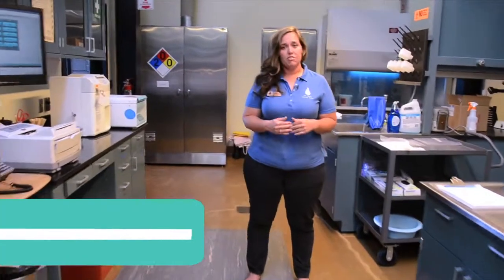Hello Ocean Ambassadors, I'm Jennifer and today we'll be exploring the laboratory here at the Marine Mammal Center. Let's go!